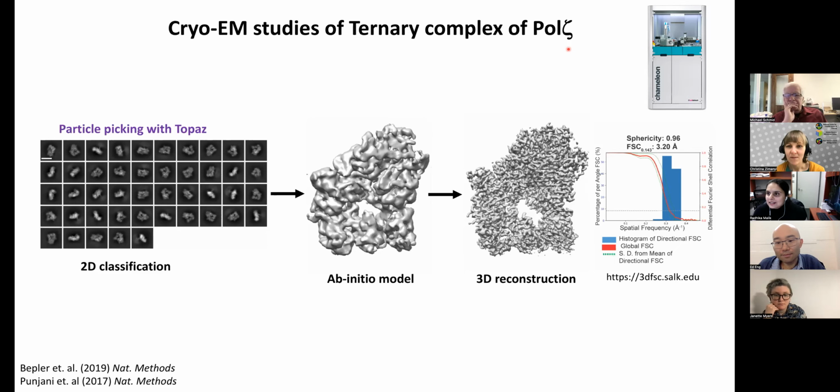That's tilting. With Chameleon, you have to go to a very high concentration of your sample. I'm talking about proteins which are not very well expressed. If you have to go to very high concentrations, then there is a drawback in Chameleon. Graphene grids are another option which you could try. Recently we have a project which worked quite well on graphene grids, which I haven't talked about here.